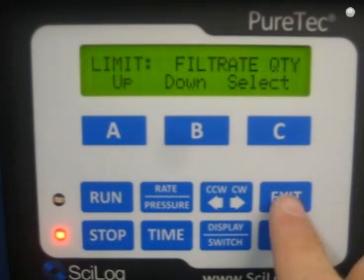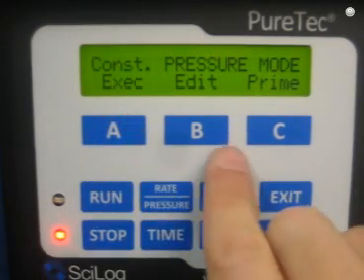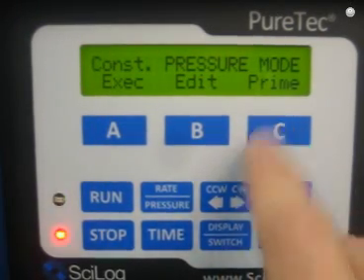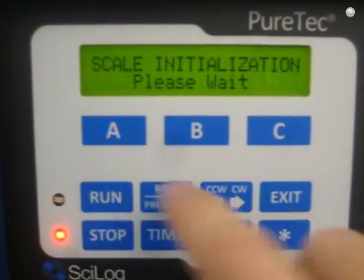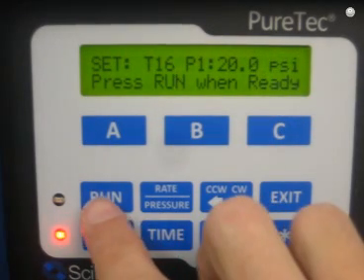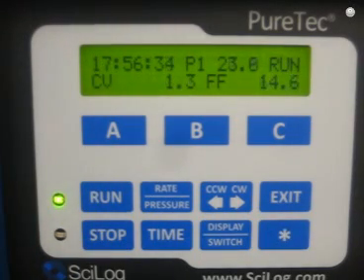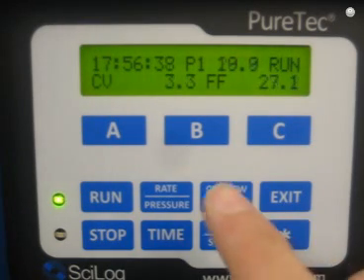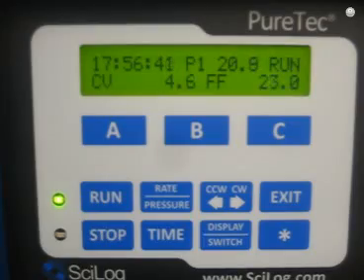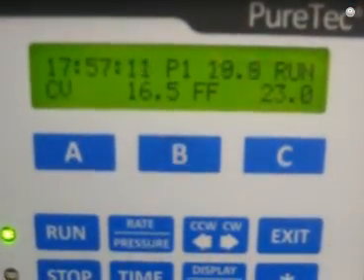At this point we are ready to run. I'm going to hit Exit. Constant Pressure Mode — now I can execute all those parameters that I just edited. I can also prime the tubing here. I'm going to execute. Scale initialization, and press Run when ready. It is now tearing the scale. I'm looking over at the scale — it's got 0 grams on it. Tears automatically. And it's just going to run and try to maintain a TMP of 20. We can see the Tandem 181 head is running and the pressure is 20 PSI.